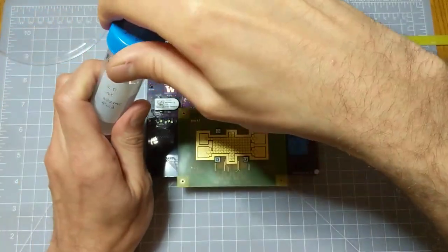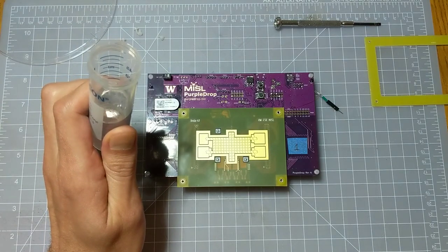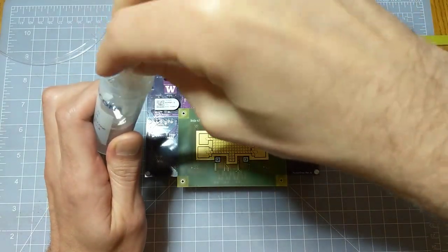Before attaching the mylar frame to the electrode board I put down a thin layer of silicone oil, it's 2 CST viscosity. I usually just do this with a kim wipe.